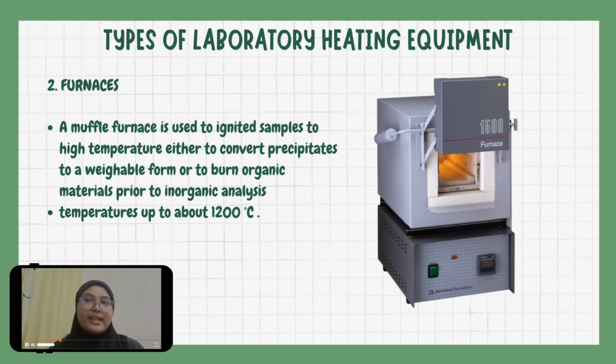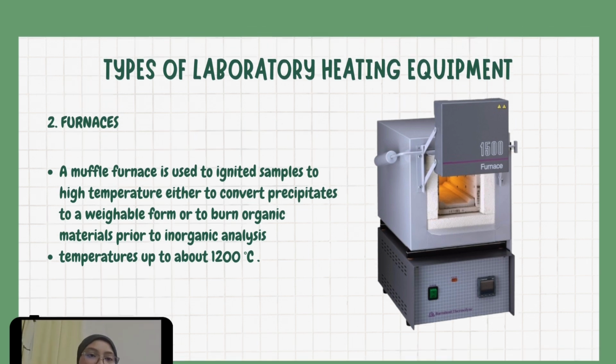Next, we have the furnace. A muffle furnace is used to ignite samples to high temperature, either to convert precipitates to a weighable form or to burn organic materials prior to inorganic analysis. Temperatures up to about 1200 Celsius.